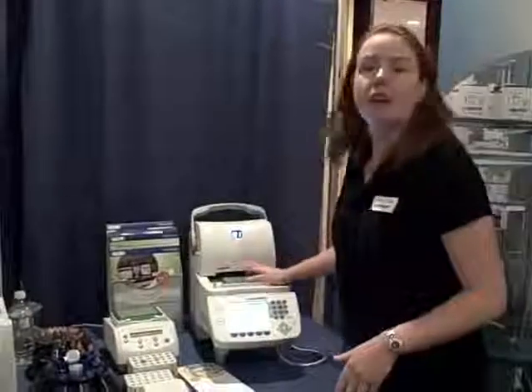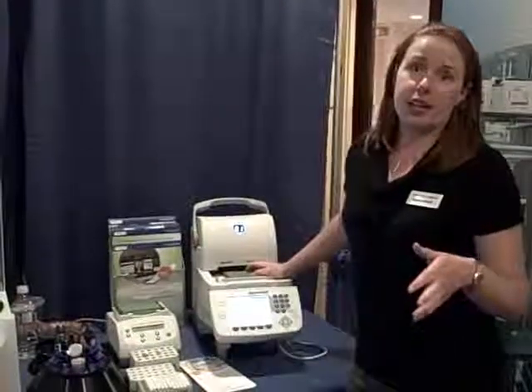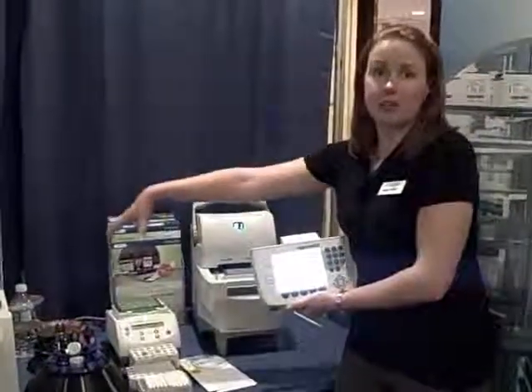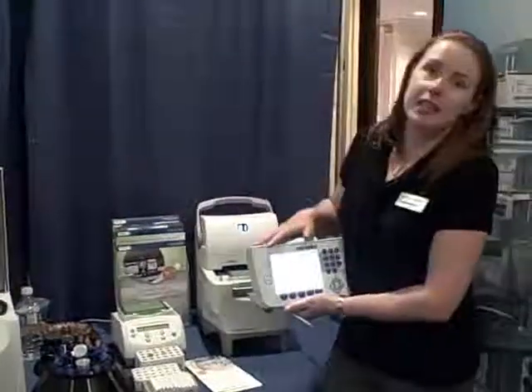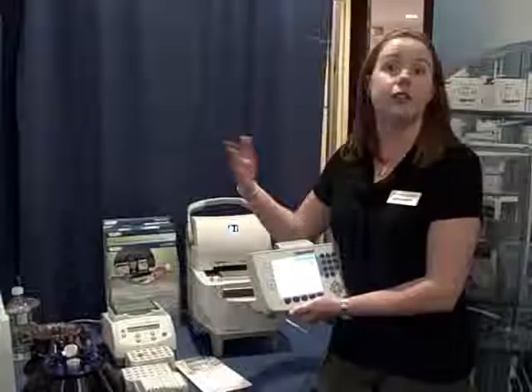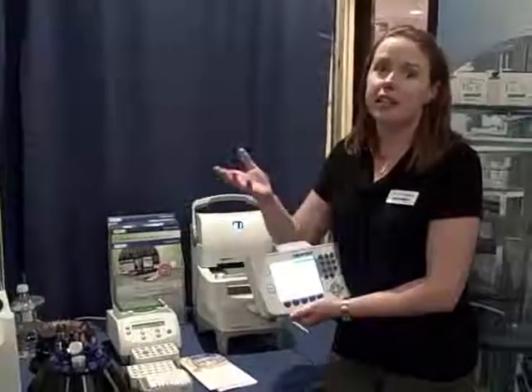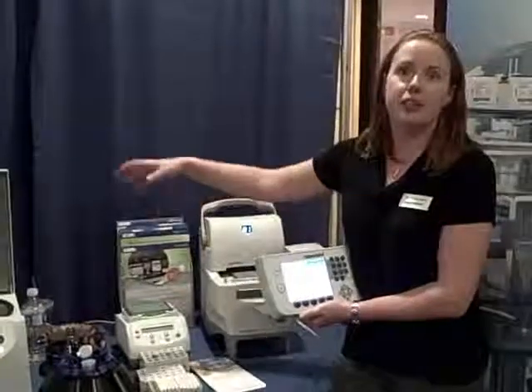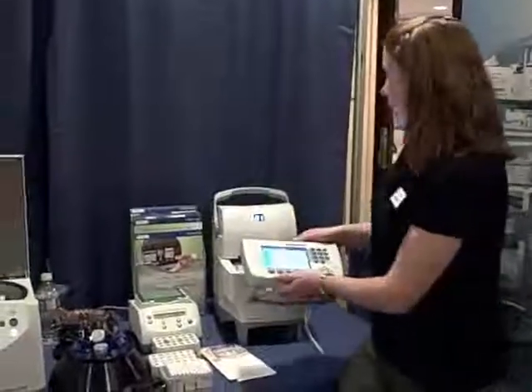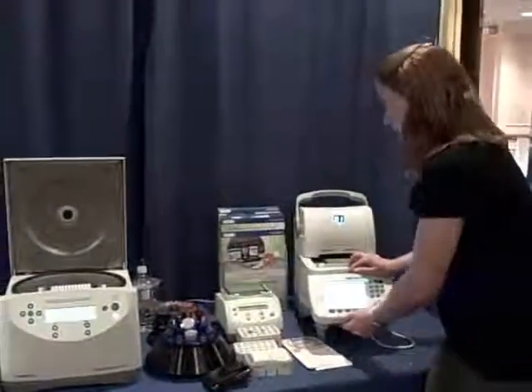So this is it here. The really nice thing about this Cycler is that one control panel can control up to five machines. We have bundles available with the panel and a block, and then in the future, if you're expanding your lab, you can actually just buy additional blocks. Everything's controlled by the controller, which makes it very cost effective as well.